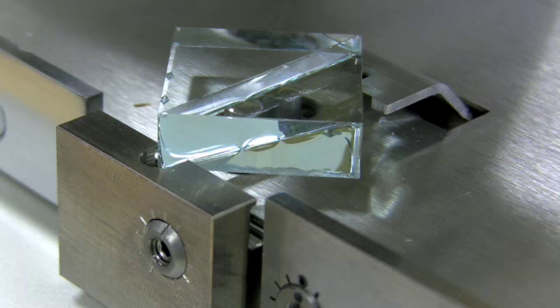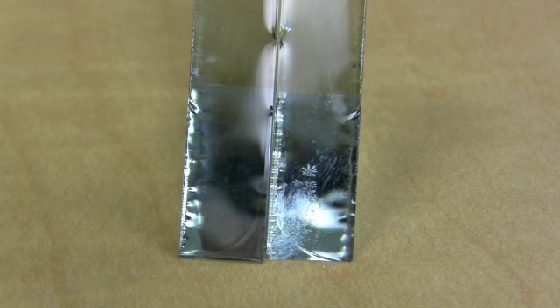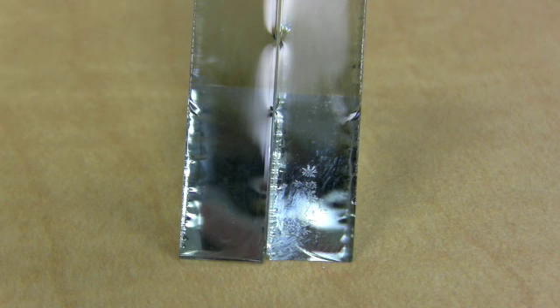When examining the two knives created from the break, it's very difficult at first to tell which side is the cutting edge and which side is the knife shoulder. If we look carefully at this blade on the left, we can see a flat edge. That signifies that that's not the cutting edge of this blade. If we look at this blade on the right, we see that that little edge is not there. That is the cutting edge, and that means that's the edge we're going to use to cut our sections using the microtome.